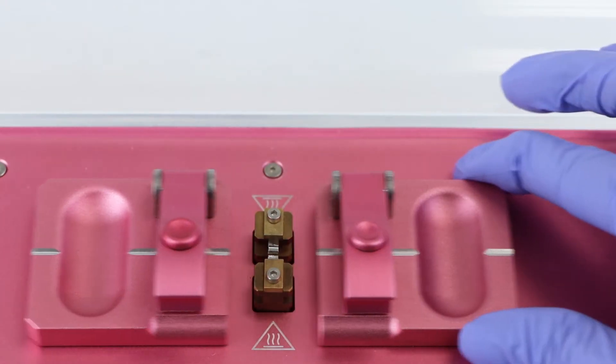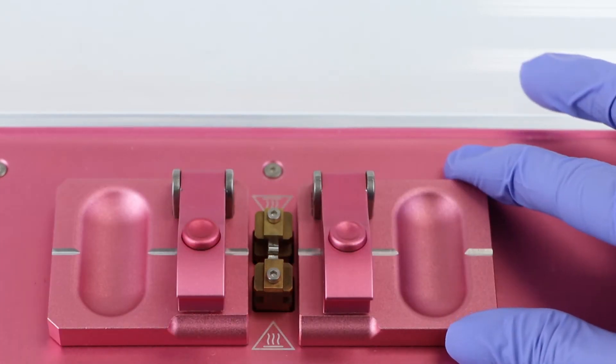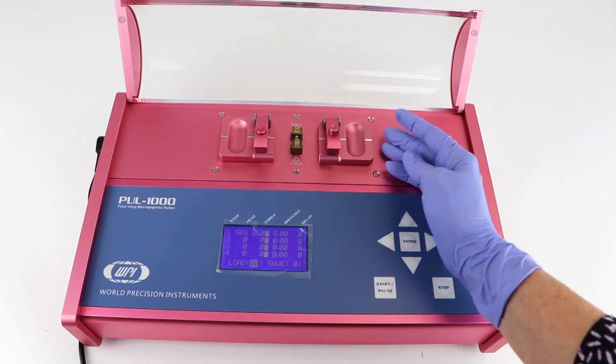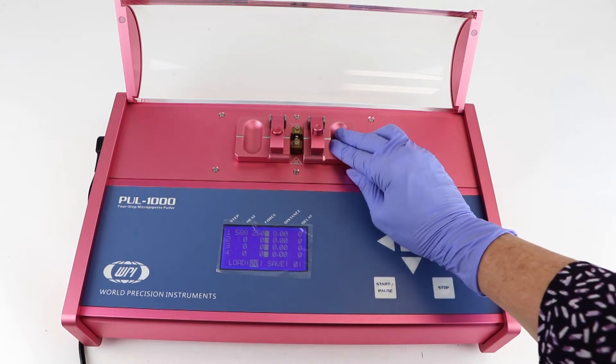The glass capillary is held by clamps mounted on two movable carriages. Both carriages synchronously slide as a program is executed. Manually slide them back together when you are loading the glass.